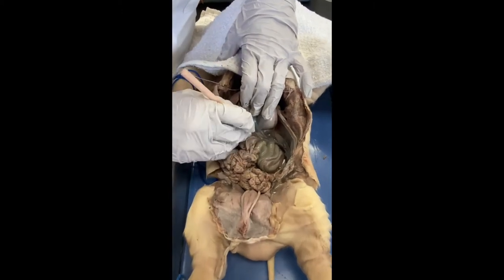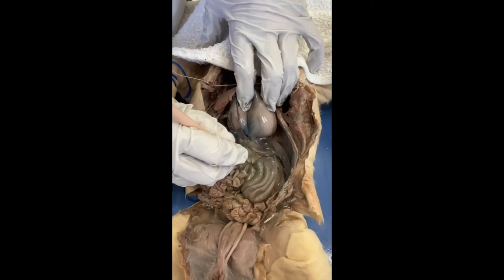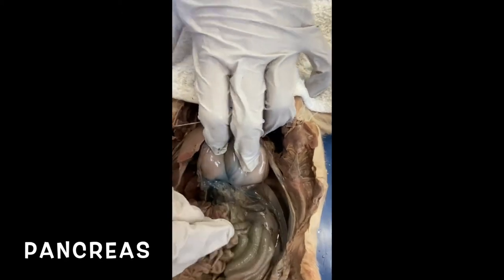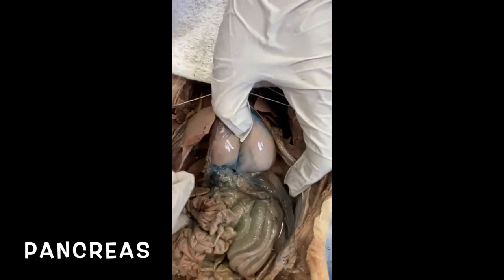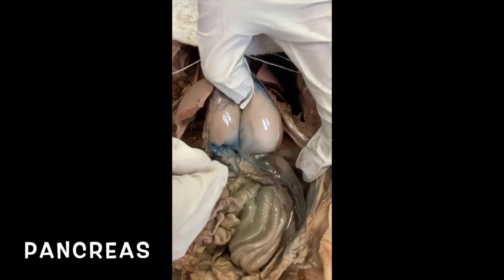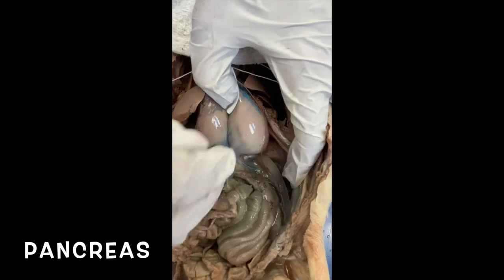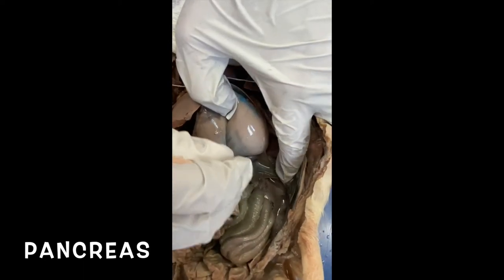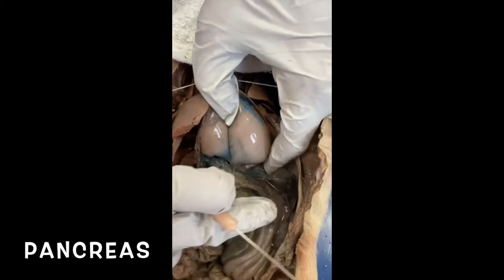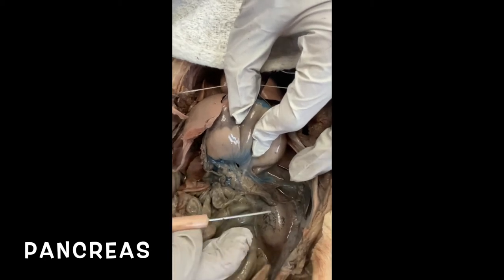Hardest organ to find. I actually saved it to show you guys how hard this is to get to. This is the pancreas, and it is very spongy. And if I play around too much in here, I will end up nicking an intestine and we will have waste. But there's a lot of connective tissue. There's the tail of the pancreas down here. So when we're looking at the pancreas, it is like a sponge. Very difficult to operate on.